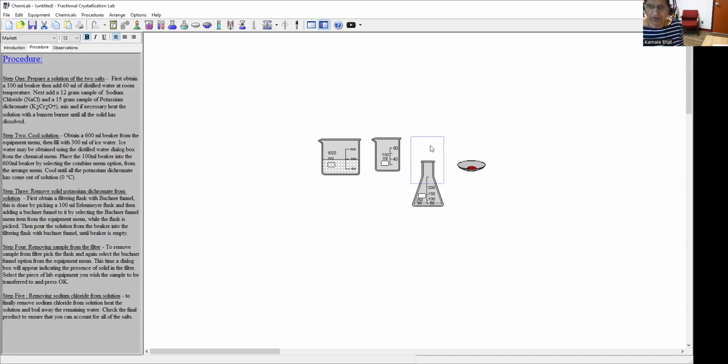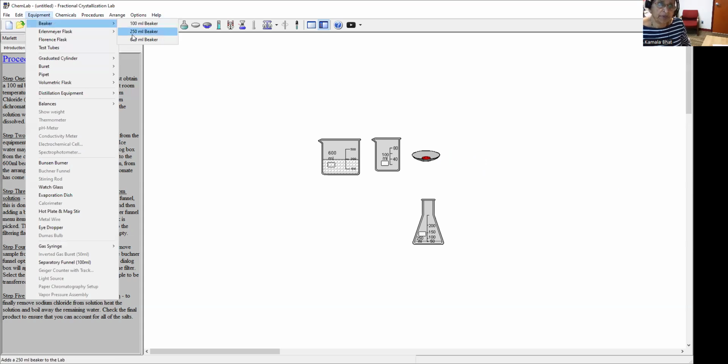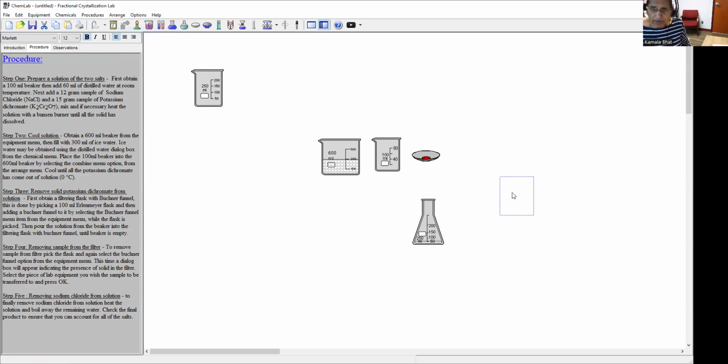And so now there you have it. Now I'm going to keep it here, and then I'm going to get another beaker. Now you'll say why? Because this solution is not water. It has got some salt in it, and therefore we have to take a beaker again, and then pour the liquid.